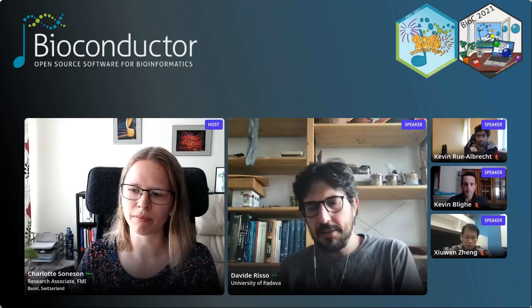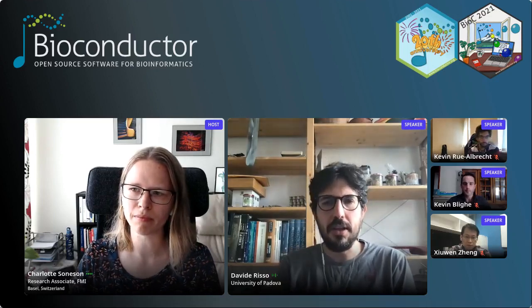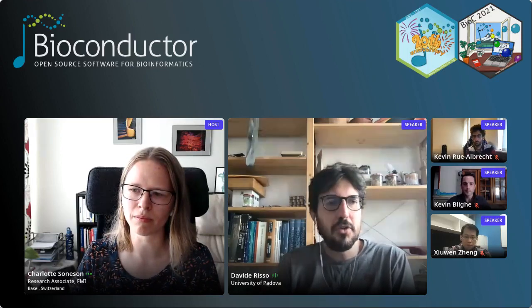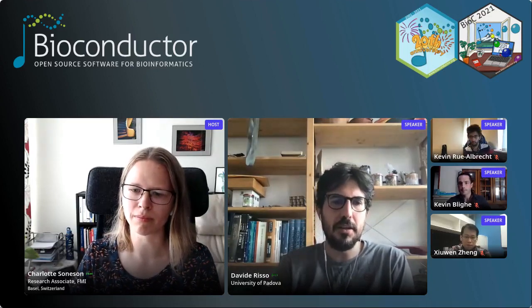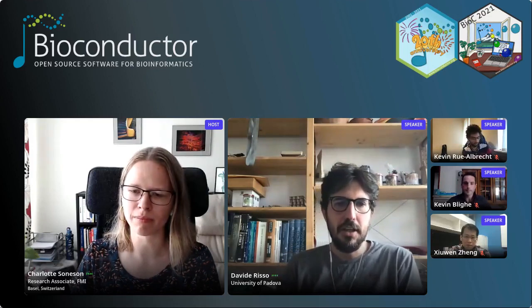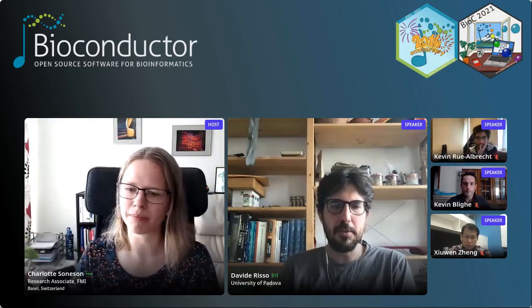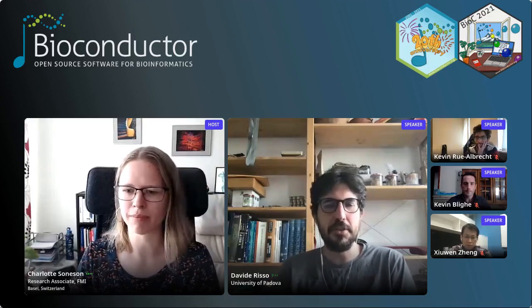And then in terms of pre-processing, well, actually we don't do any pre-processing at all. We do the usual kind of normalization for sequencing that you can put as an offset in the model, as usual, and that's it. That was actually the main motivation for this work, to have a model that works on counts. Because of course there are many graphical models on Gaussian distributed data, but that requires pre-processing.